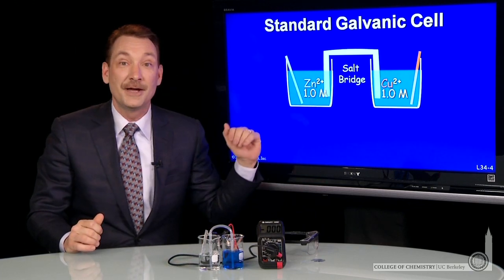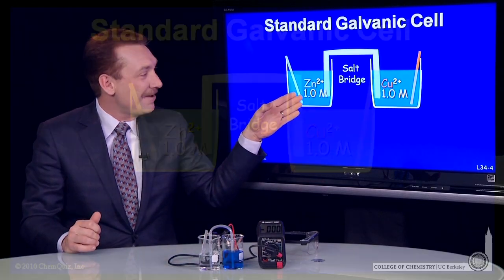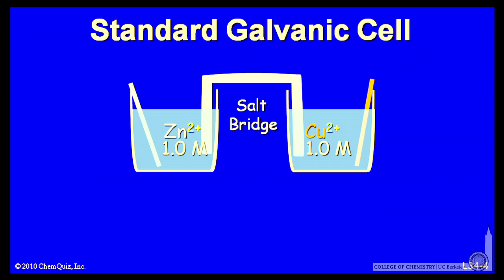So I can set up a system where I have the reducing agent and the oxidizing agent in separate beakers. Here I've done a zinc electrode in zinc solution and a copper electrode in copper solution.